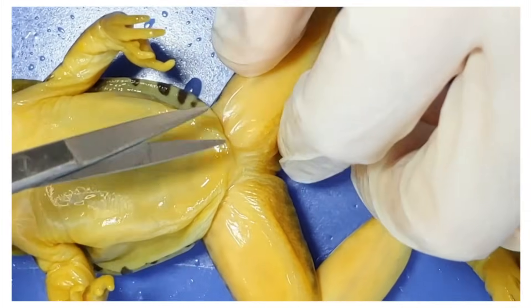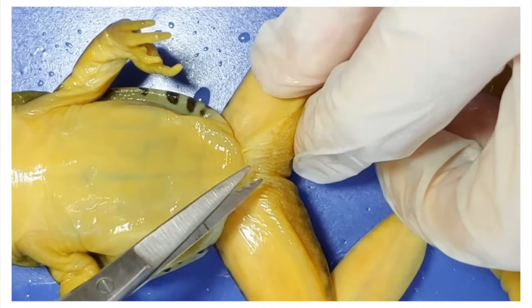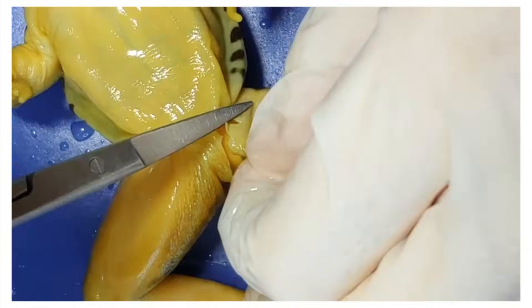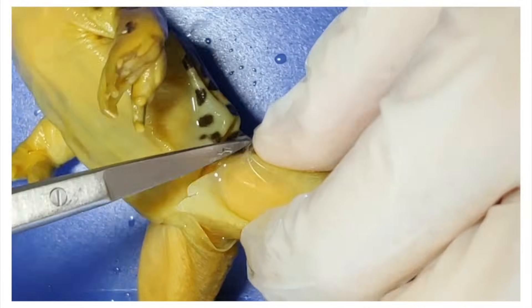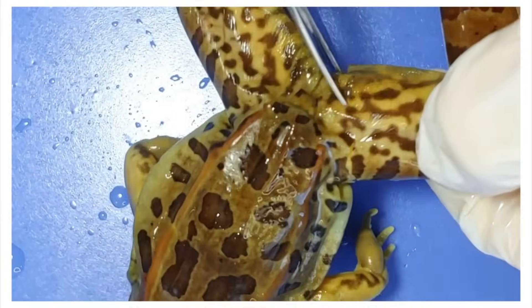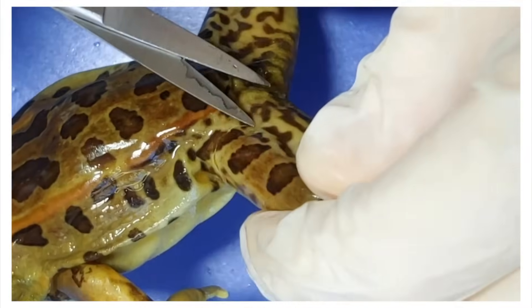Let's get down to the internal anatomy. First, I'm going to peel the skin off one of the legs — kind of like peeling off a pair of jeans when you get home after a long day. An interesting fact: frogs absorb water through their skin so they don't need to drink.